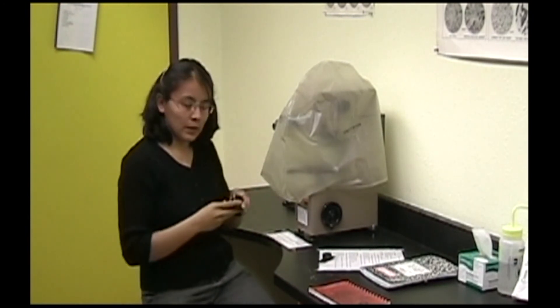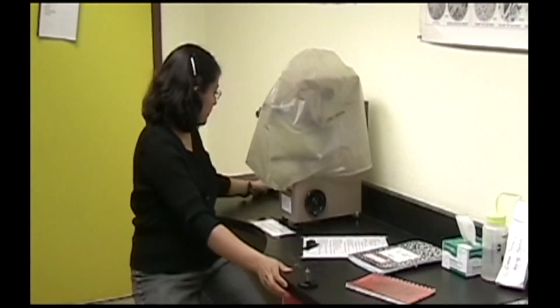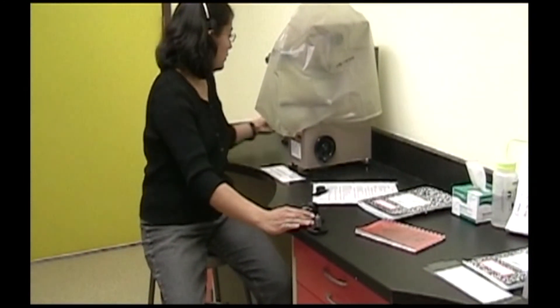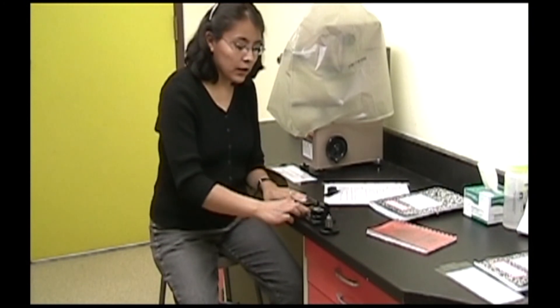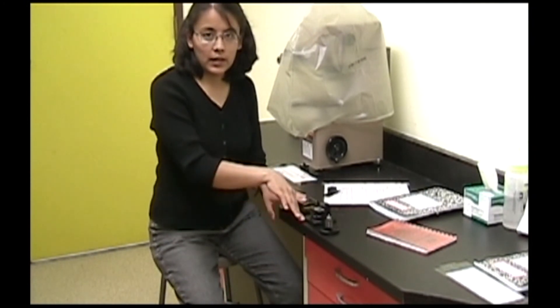We have sample holders for testing the micro hardness of wire, for flat samples that aren't mounted, and for bars and rods. You should contact the person in charge of maintaining this room in order to use the sample holders.